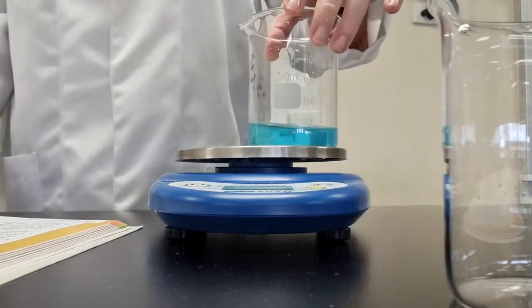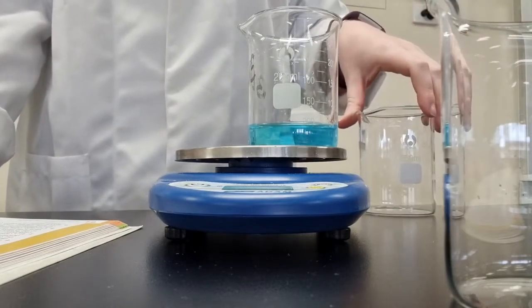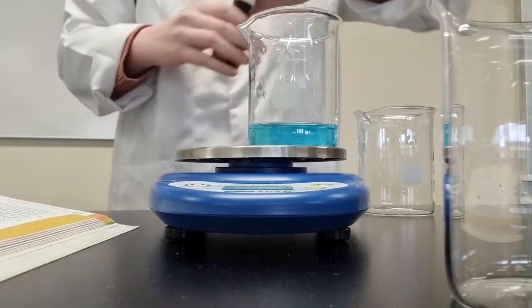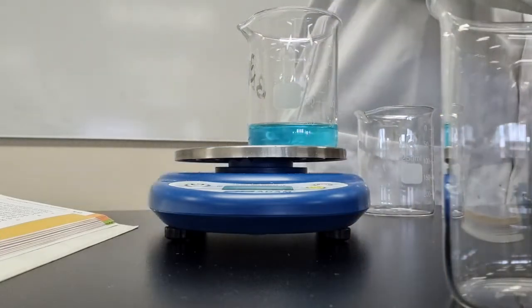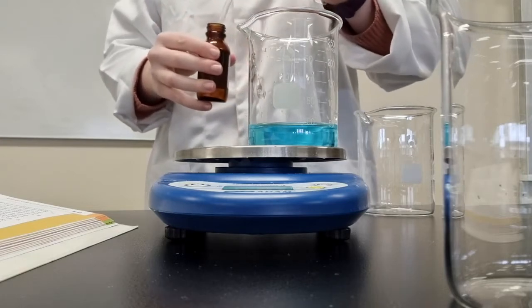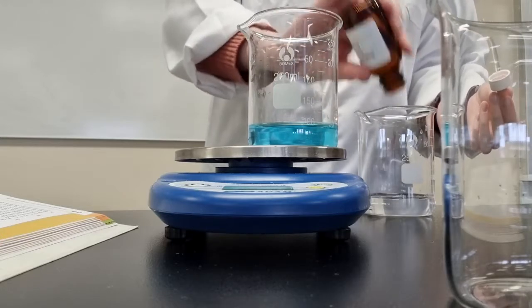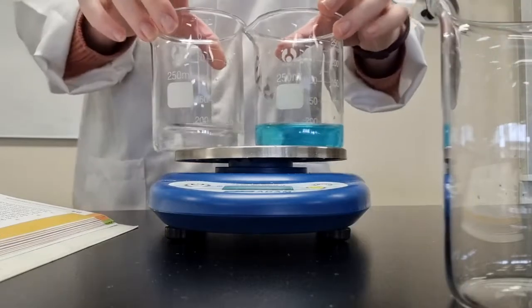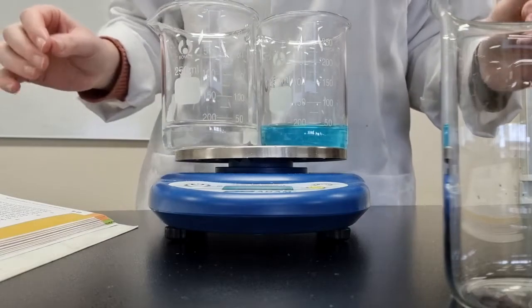Okay, so we've got our copper sulfate in here. The next one that I am going to put in is sodium carbonate. Again, I cannot open that. Drop a bottle. And I'm going to do another 50 mils of that. I am going to weigh them together so we can get the before mass.